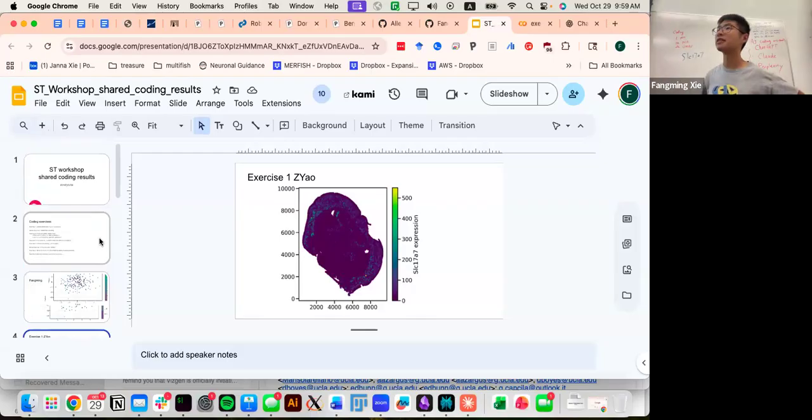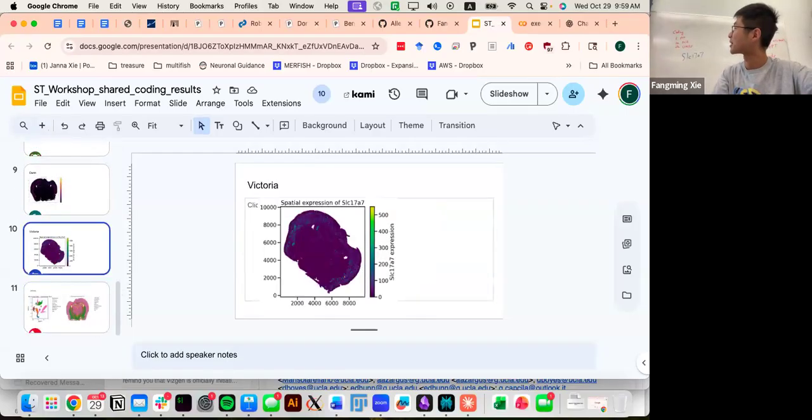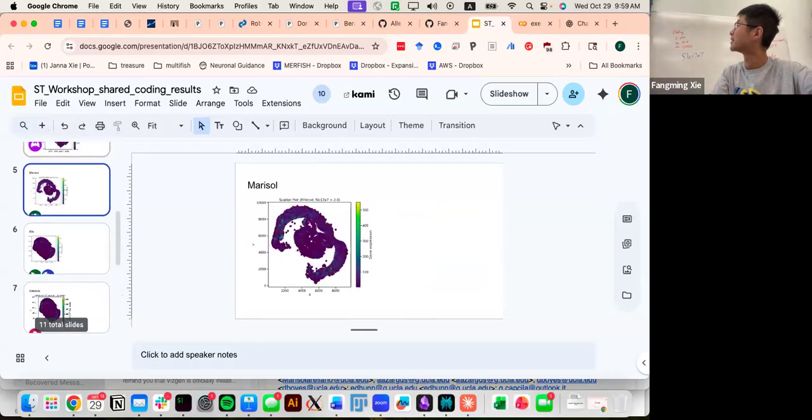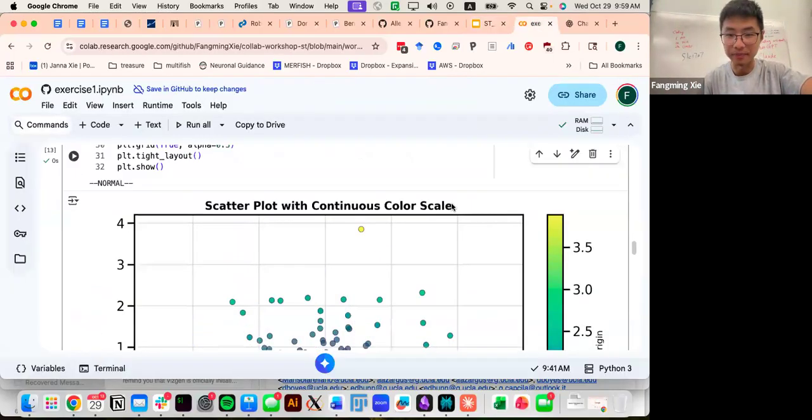Okay, let's try to go over this a little bit together. It looks like many of you have made a lot of progress. Wow. Good job. And anyway, let's do it together.